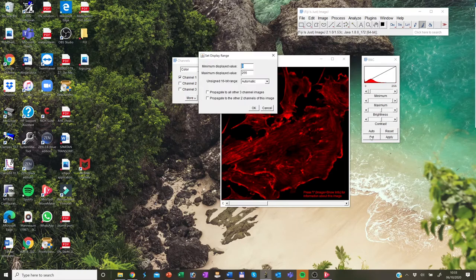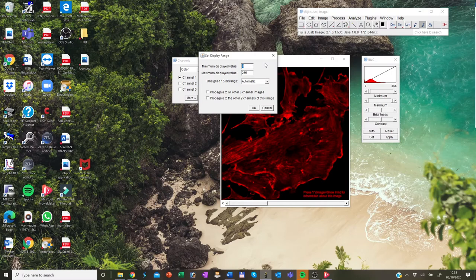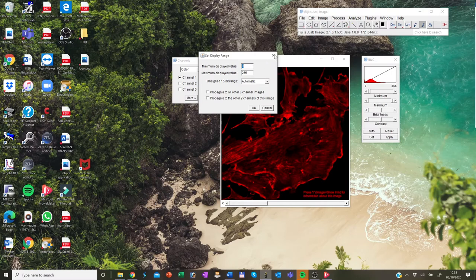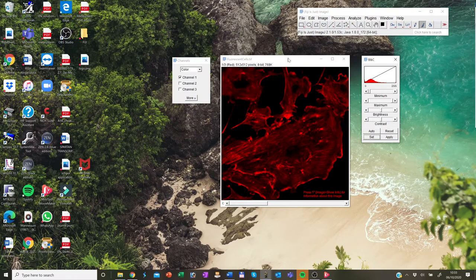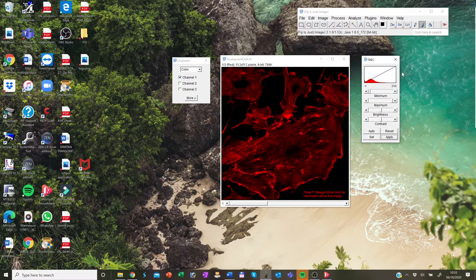And if you click apply, that will apply the current display range mapping function to the pixel data.